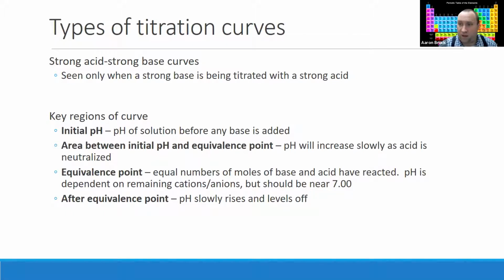And at the equivalence point, things change very, very quickly. Our remaining amount of hydrogen ion is relatively small. Our remaining amount of hydroxide is, well, again, close to nothing, but we're adding a greater proportion of hydroxide relative to the amount of H plus that is left. And that is going to cause that pH to spike dramatically. That's what we call the rapid rise region in the curve. It is going to go up considerably in very, very little amounts of base.